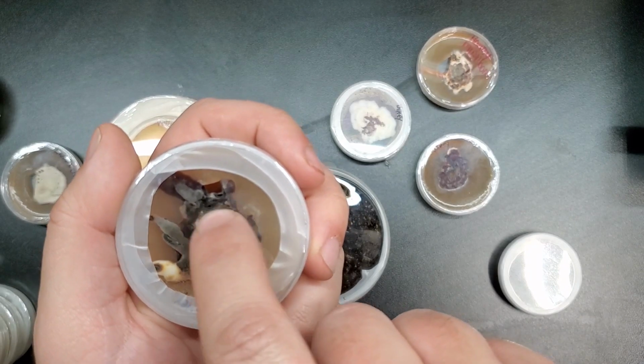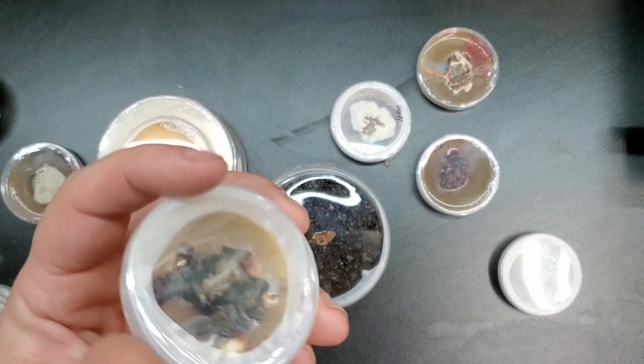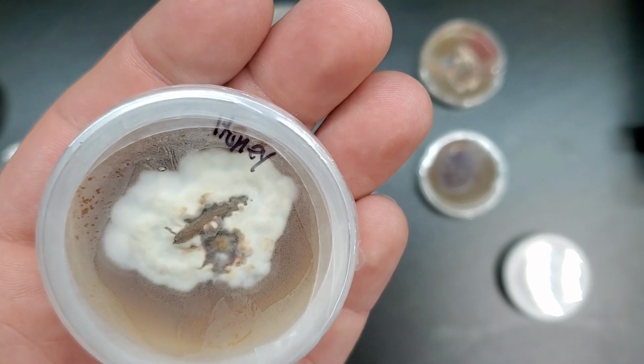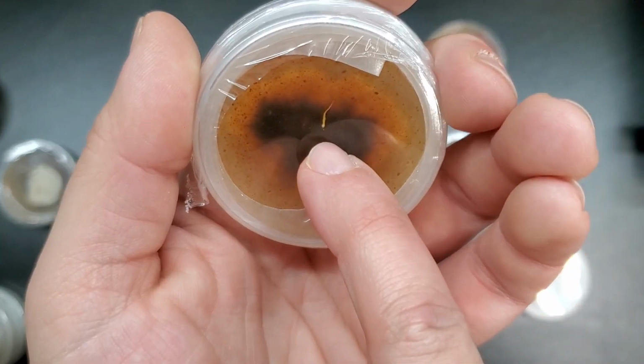Anytime you see a square or a chunk of agar missing, it's because I took a piece of tissue from that Petri dish. This is more what you would expect from a mushroom on agar. Just kind of white mycelial growth. And oh, I guess you can kind of see, right here, this one's starting to do it now.